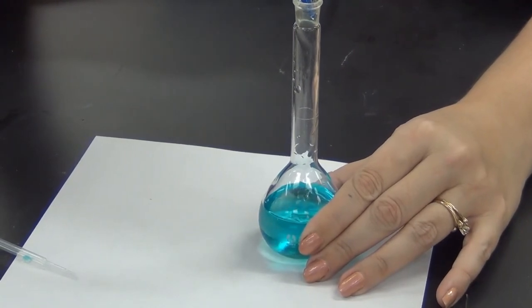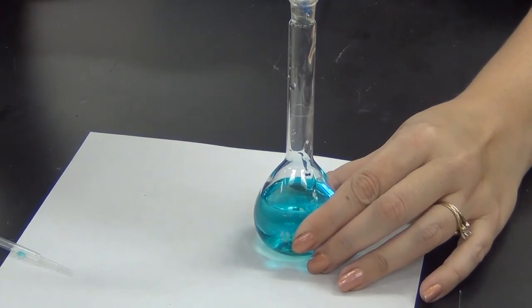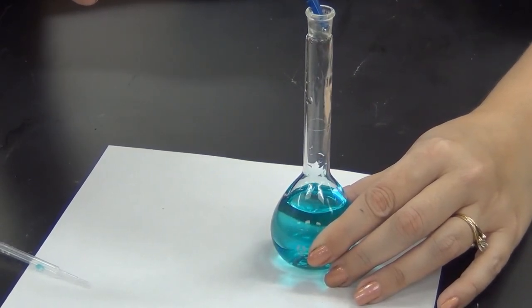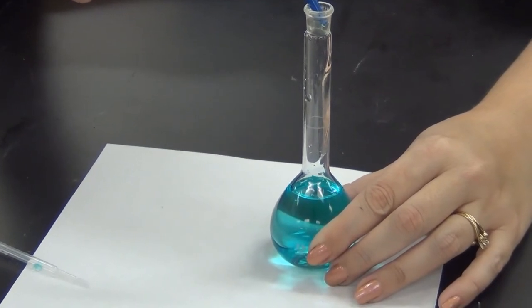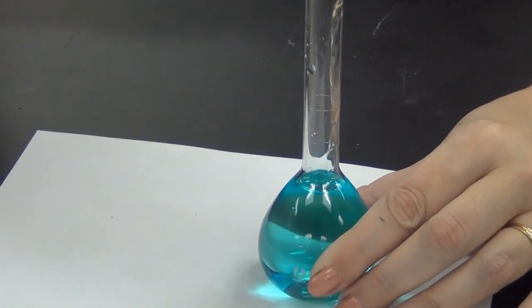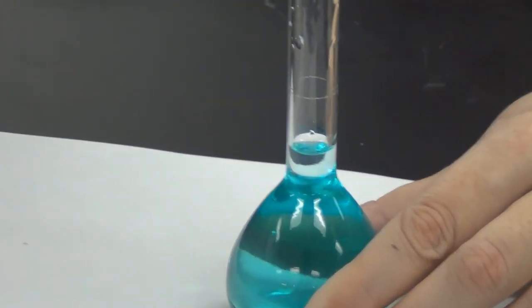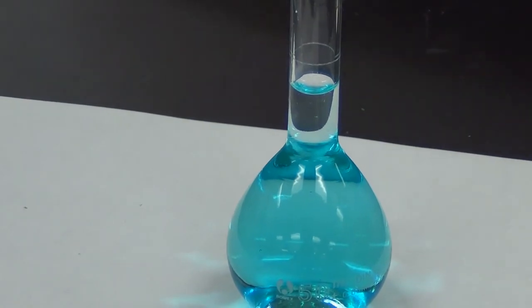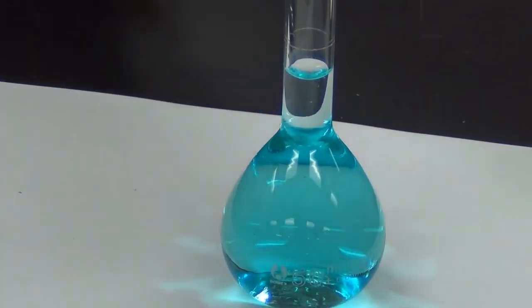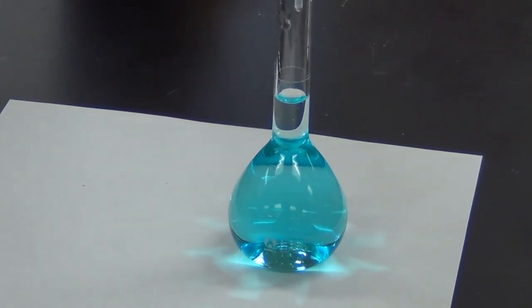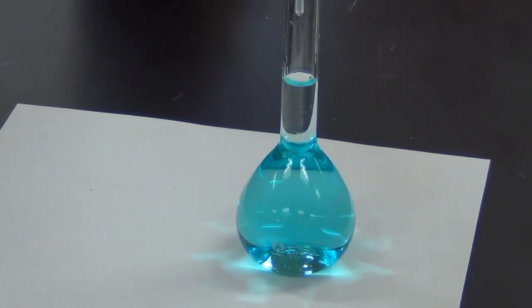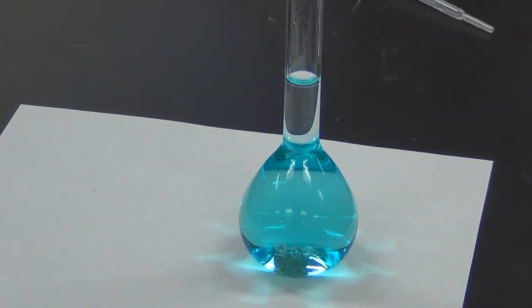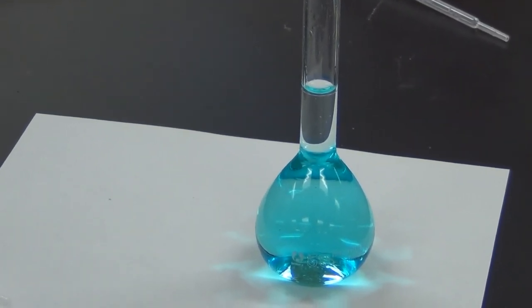Now when you start to fill one of these volumetric flasks, for the first while it feels like it takes forever because you're filling up the wide bottom part. But don't take your eyes off of it because once you get up to the neck of the flask where it's much narrower, it starts to fill a lot faster. You can see how much quicker the water level is changing as it gets up into the neck. Once we get close I'm going to use a pipette and get down at eye level, making sure I don't get any bubbles until I get right at the line with the bottom of the meniscus. That's 50 milliliters of solution.